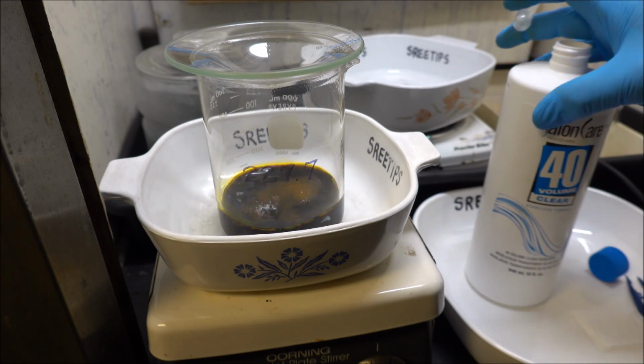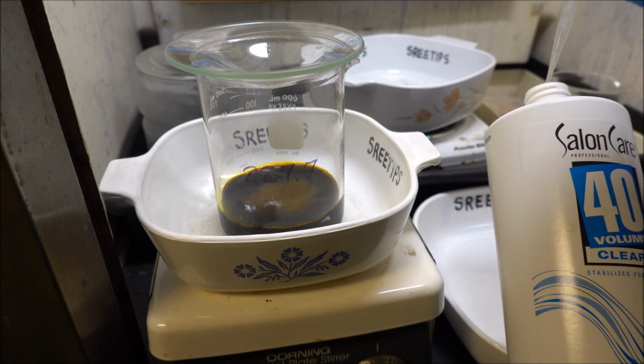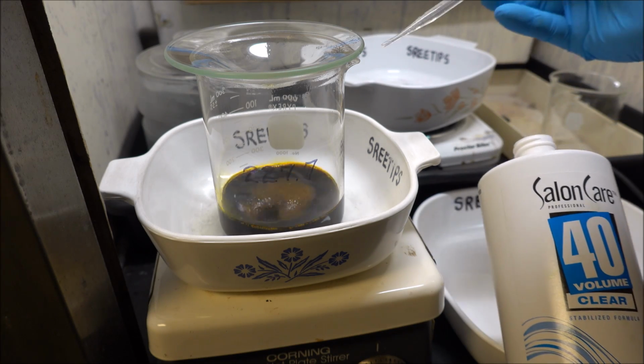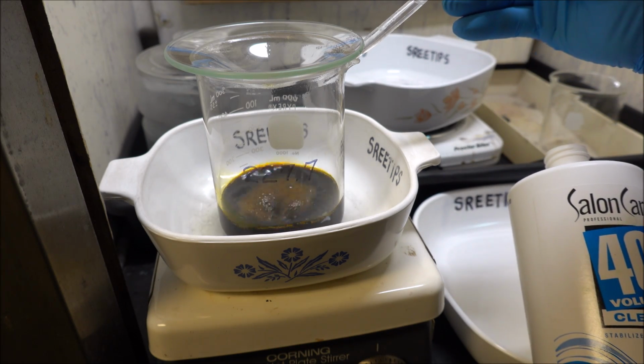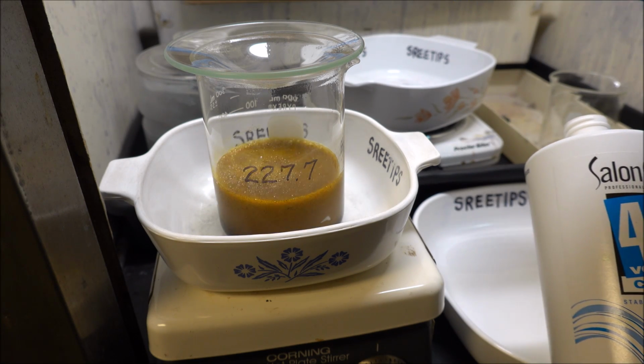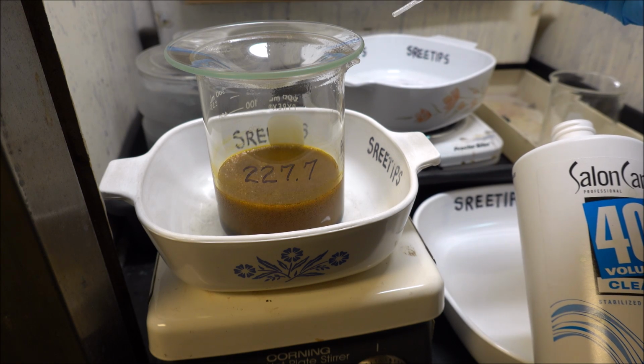What I'm waiting to see here is the reaction become subdued or a little bit less as I add this hydrogen peroxide, and that'll let me know that the metals have gone into solution.